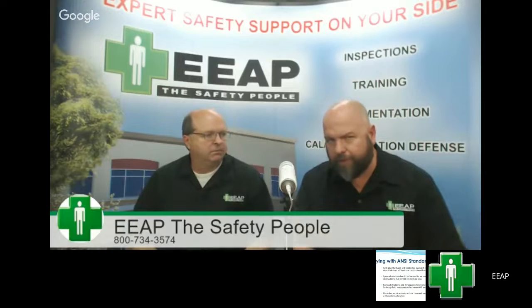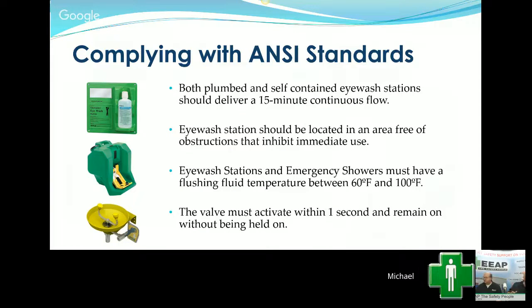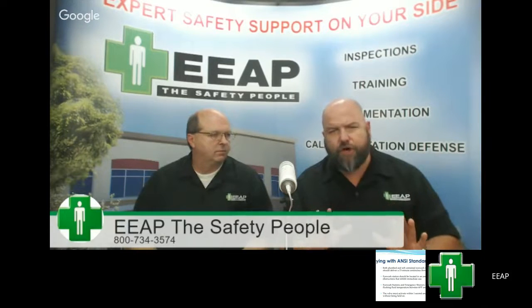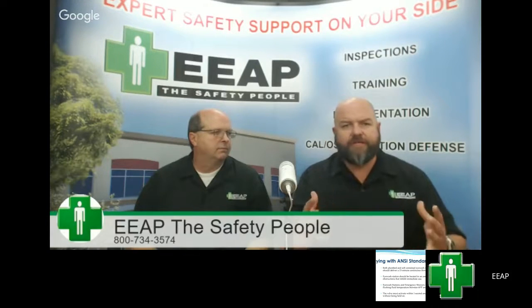Right. My favorite eyewash station is the plumbed-in one. But if you can't plumb it in and you've got the one that has the bag or something in there that you'll see in this picture Rick will put up, the second picture, something to that measure, you can go back, Rick. The logic of my concern with those is they do run 15 minutes. I do encourage you to test them yourselves. I know that you'll have to waste a cartridge or a fill, but you really want to take it and test it yourself. And when you see the water flow that comes out of there, I want you to test it and see the water flow and make the judgment yourself.